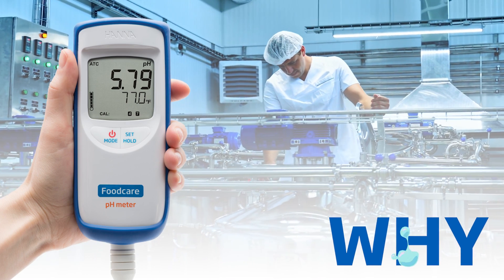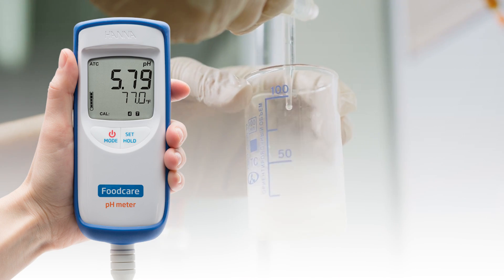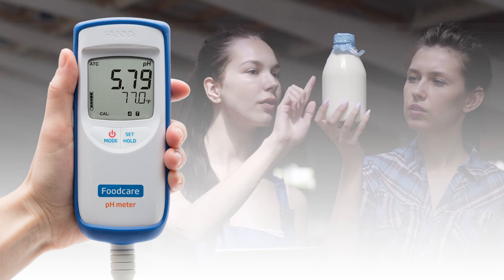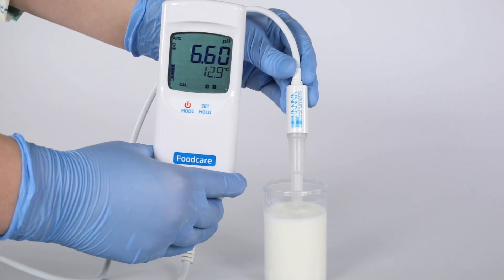The HI99161 can go where traditional benchtop units cannot, eliminating the need to pull samples and run them across the facility to the lab. This saves time and money, ensuring you can spot check pH whenever needed.